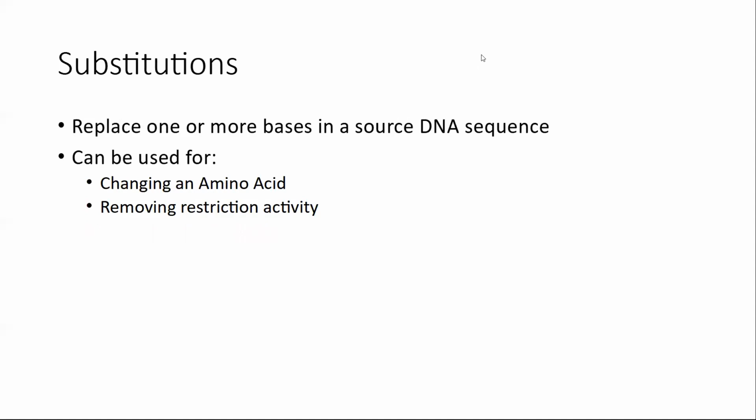Substitutions are taking what's already there and changing some things. These are typically easier to do because you're not inserting as much there. Because when we do insertions and deletions, typically that has to be on the ends of the primers, which may not be suitable for that region. With substitutions, the primers are going to anneal most of the time. So we don't have to worry about as many problems as far as the PCR portion of the protocol.